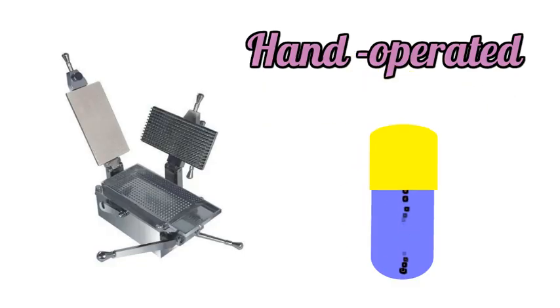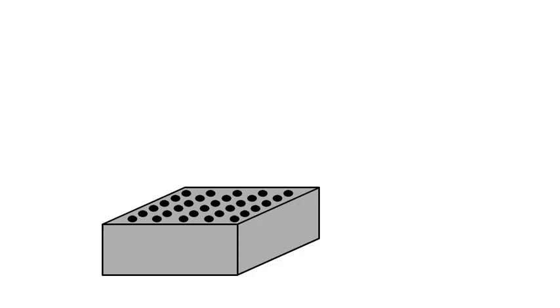First, let's understand different parts of a Hand-Operated Capsule Filling Machine. This is a bed with holes. It has holes ranging from 100 to 300 and actual filling and sealing of capsules take place in this part of the machine.